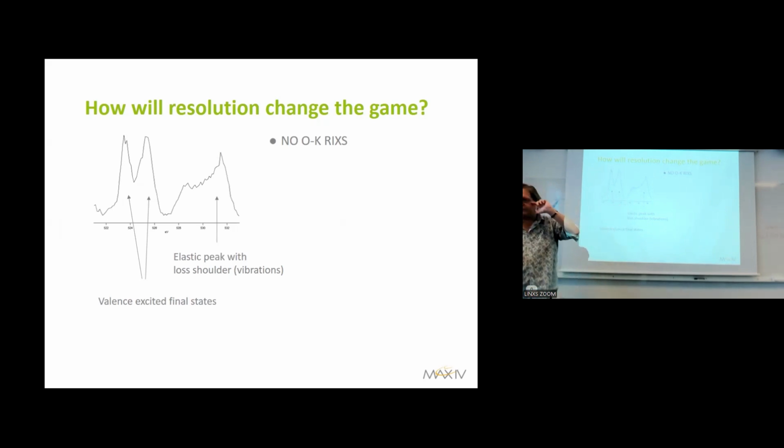So I can of course do a lot of calculations. This is of course vibrations, so this is vibrations being set up because of the excitation. I can fit this to the expected lifetime and so on, and do a lot of things. This was published, so it's the thing to do. But there's clearly more happening here.